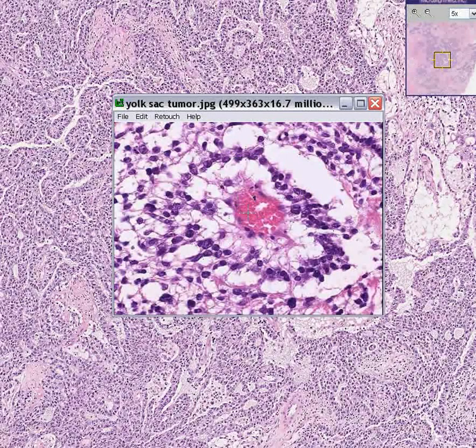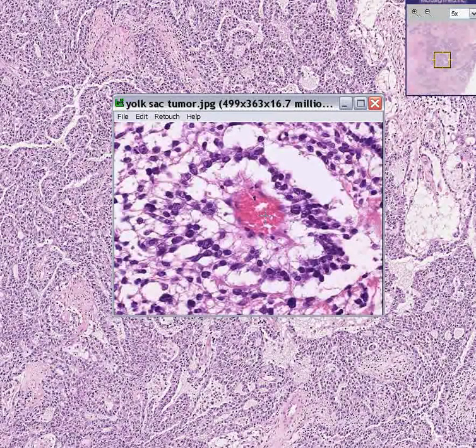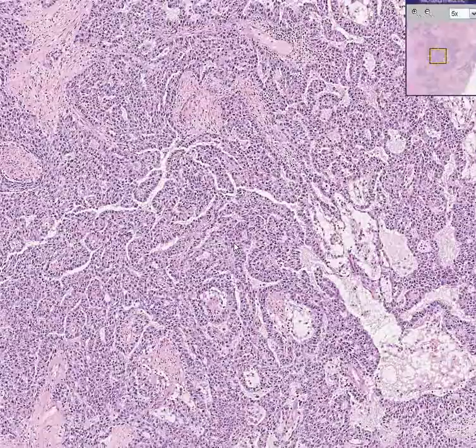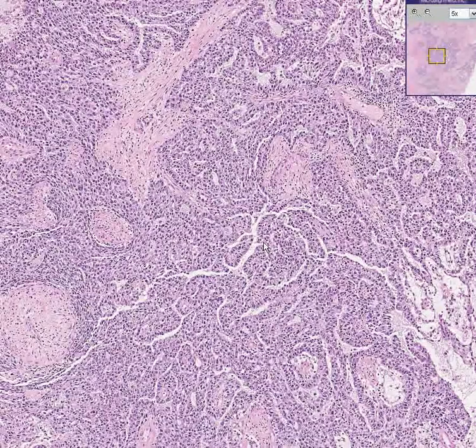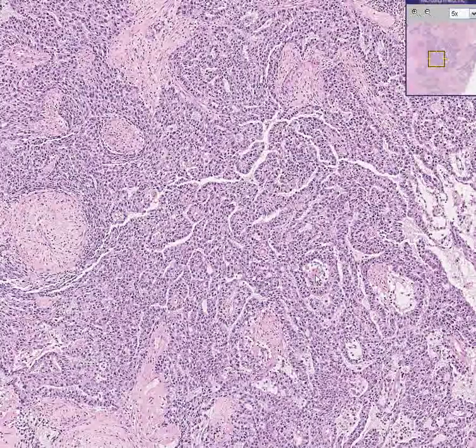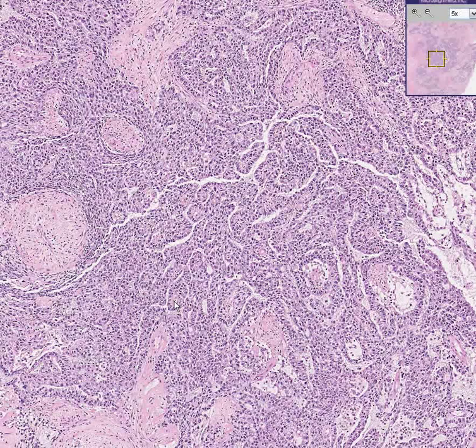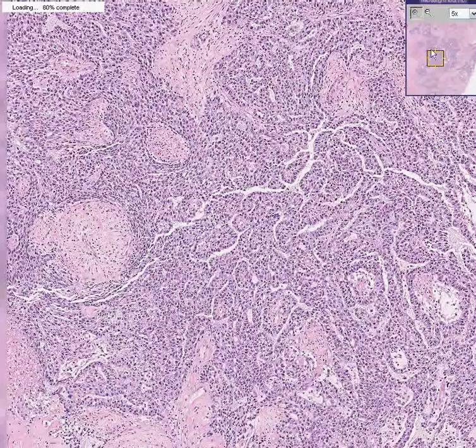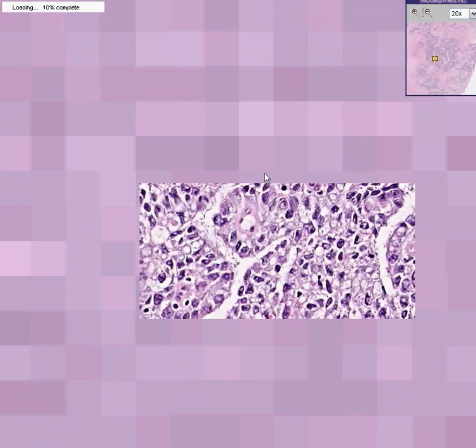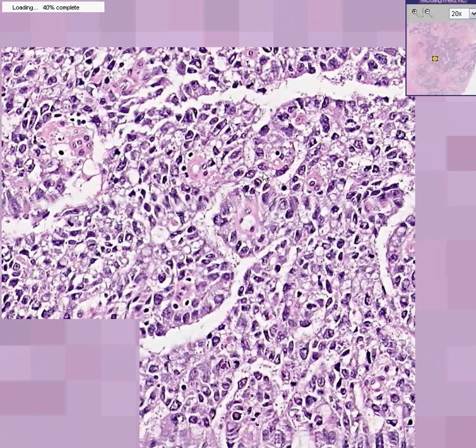That is a classical Schiller-Duval body, making this diagnostic of a yolk sac tumor or endodermal sinus tumor. Now returning to our regular specimen, I think you can see — perhaps here, perhaps here where we see a blood vessel, perhaps here — imperfect but recognizable Schiller-Duval bodies showing this perivascular pattern of growth, in which the tumor cells grow around the blood vessel.